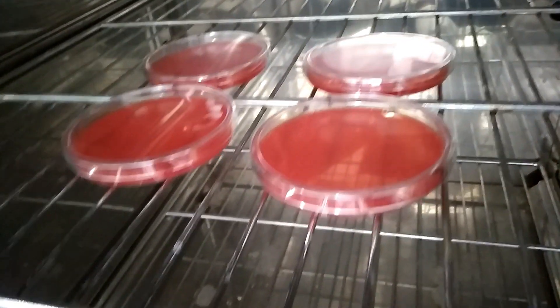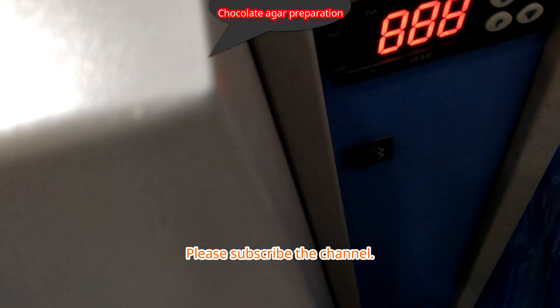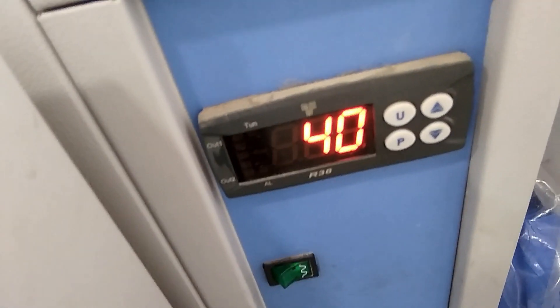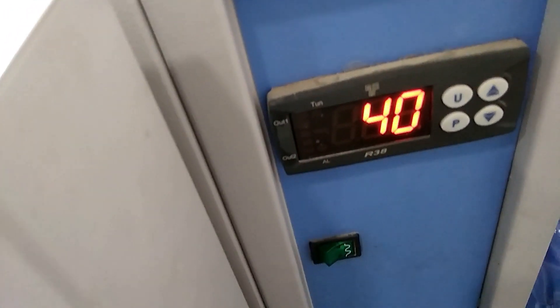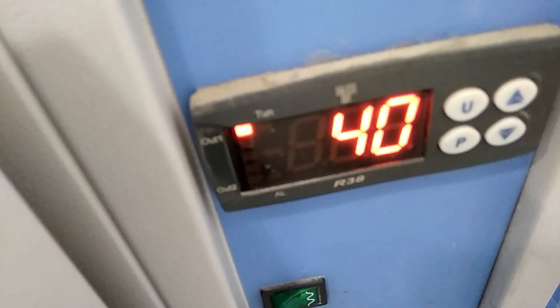Now close the incubator after putting these plates. Adjust the temperature up to 72 degrees Celsius. Here you can see the temperature is increasing.